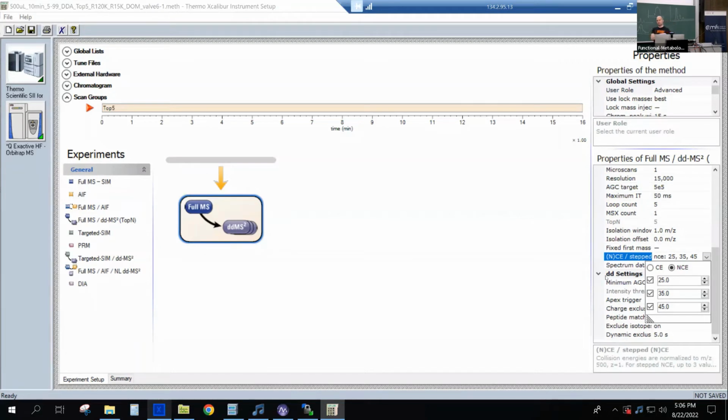Because then I can throw in samples from 5 years ago from San Diego to stuff I run now, and it's the same collision energy settings. And then I assume that they should still cluster together because they should result in the same patterns. It just divides the activation time, which with HCD is really fast, into 3 different zones at different energies.